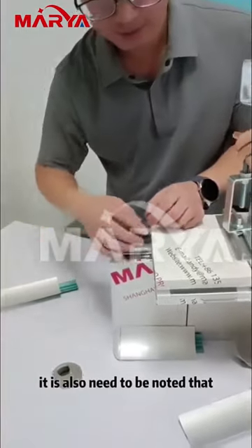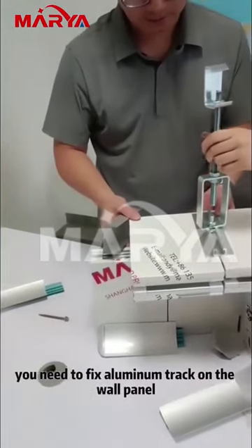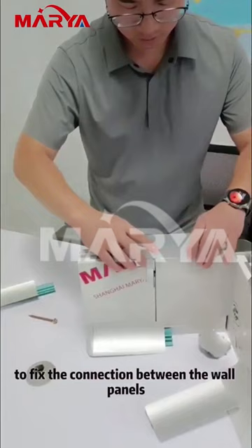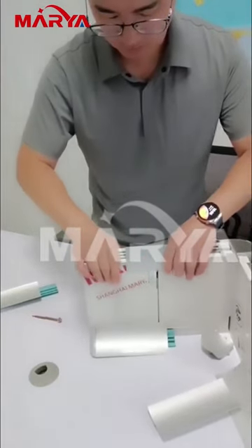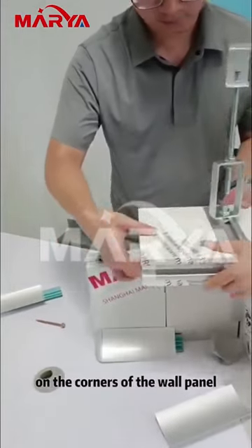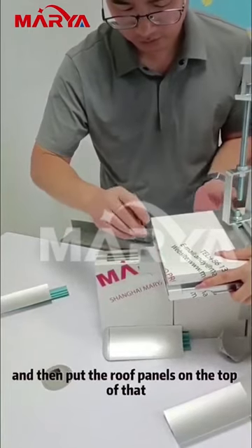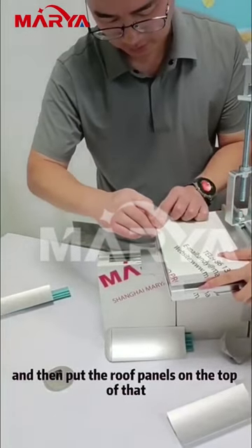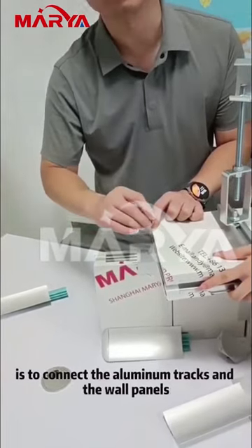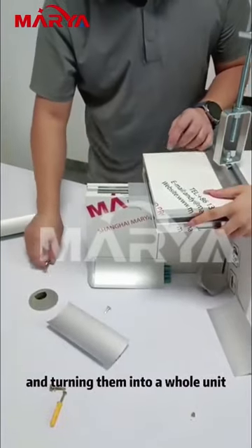It should also be noted that before fixing the wall panel, you need to fix the aluminum track on the wall panel to secure the connection between the wall panels. Put the round-head dovetail screws on the corners of the wall panel to fix the wall panels and the aluminum tracks, and then put the roof panels on top. This screw connects the aluminum tracks and the wall panels, turning them into a whole unit.